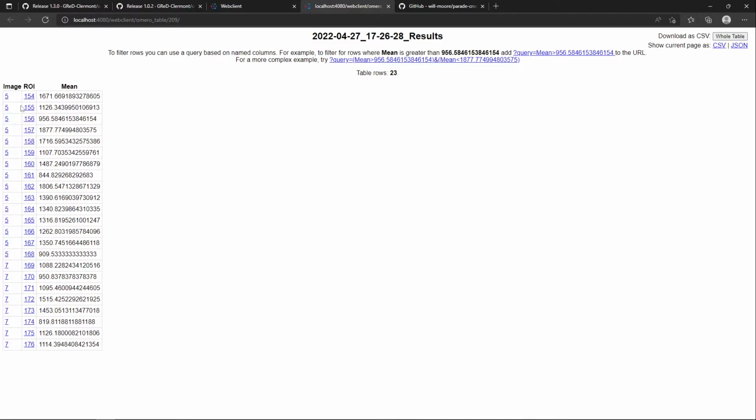So once again, how are the ROIs, the regions of interest, linked to their IDs in OMERO? Well, it's because the results table in ImageJ contained a column named ROI, which contained the local index of the region of interest, and the plugin matched it to the OMERO ID.